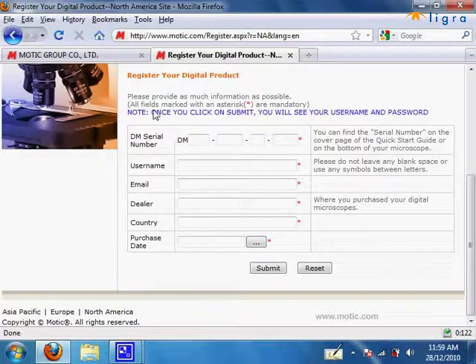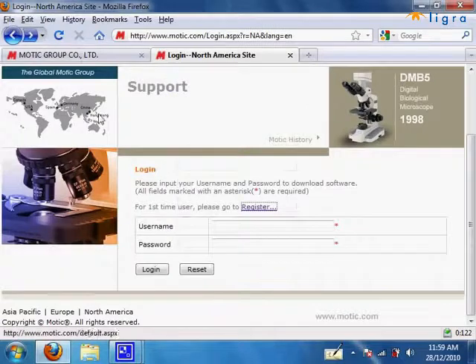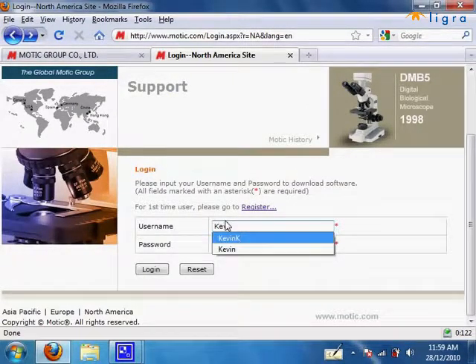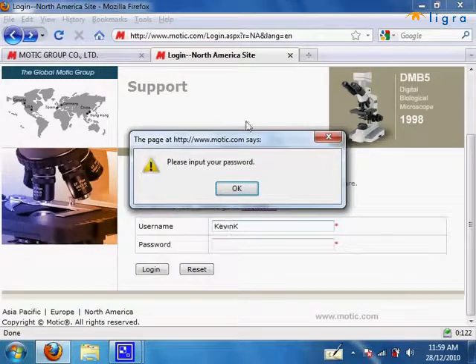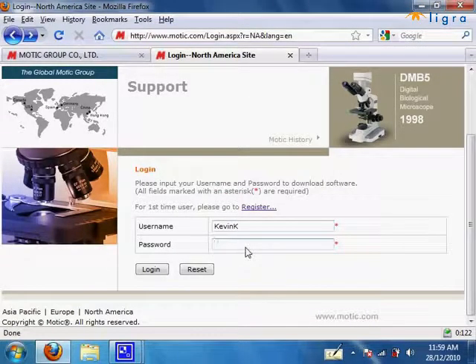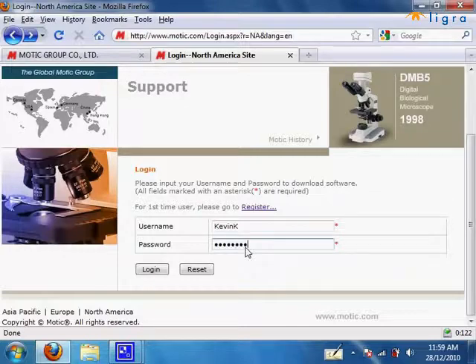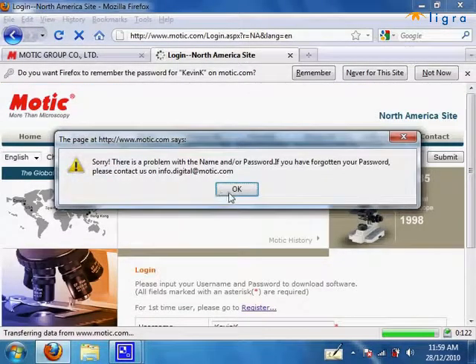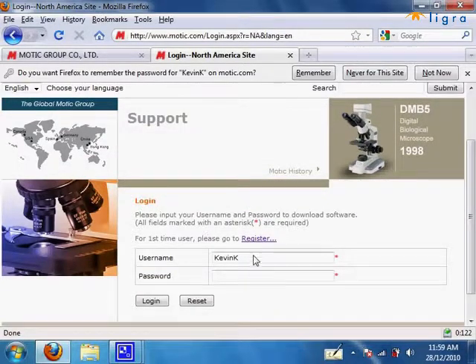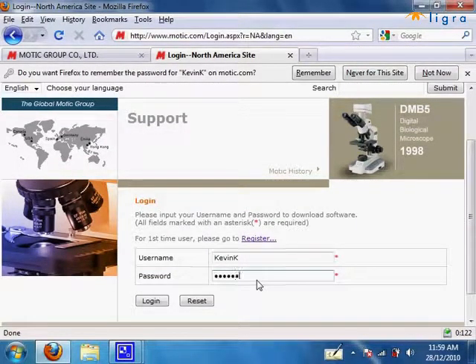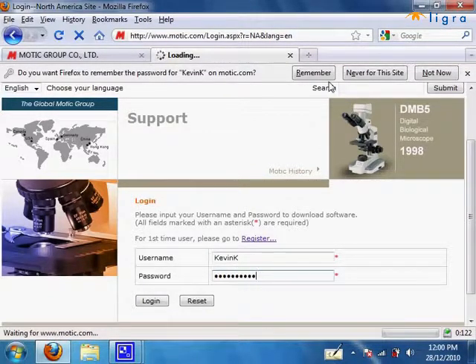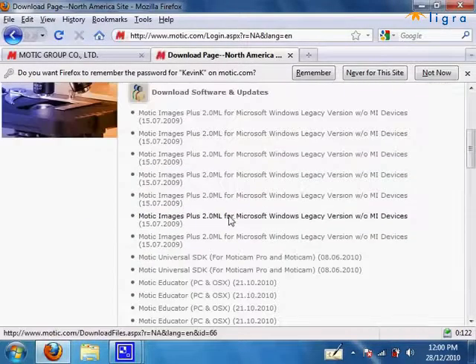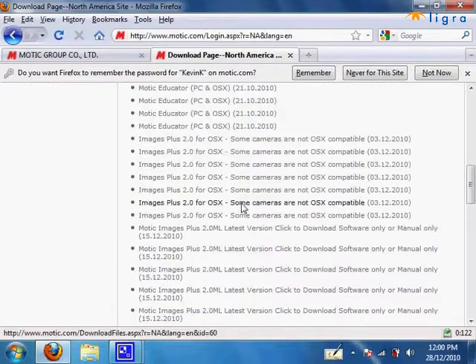But since I already have mine, I will not register again. Fill in all the fields and you should be able to get a login with a password. Type it in now.